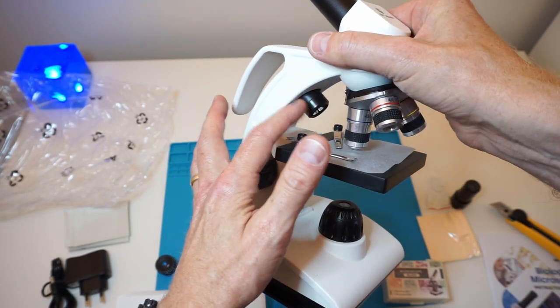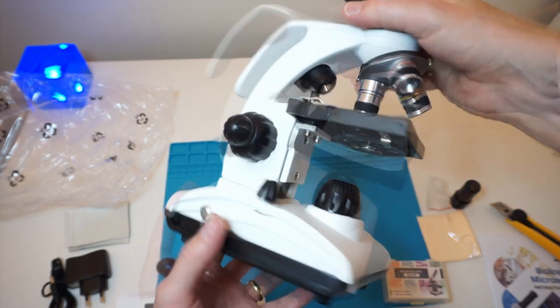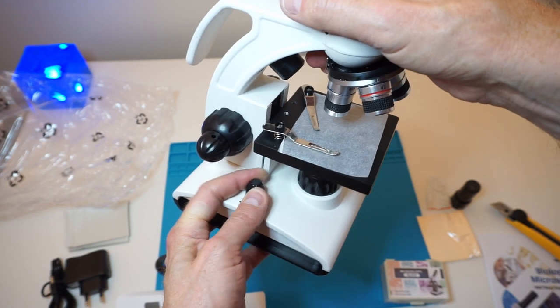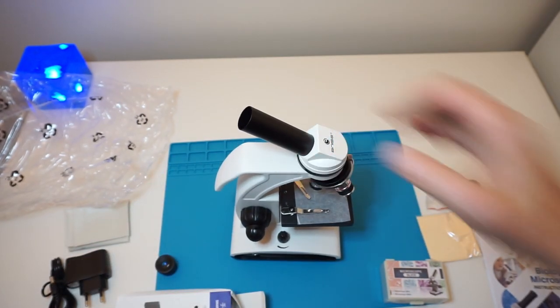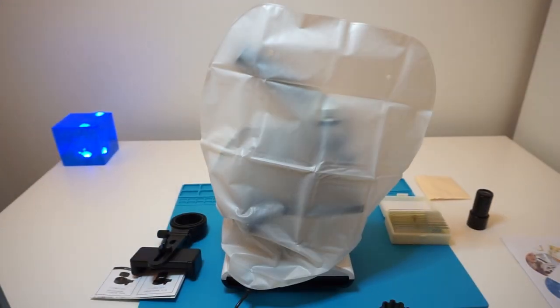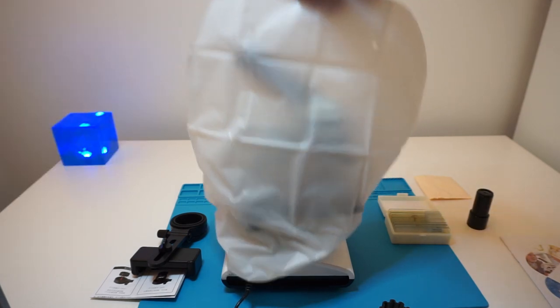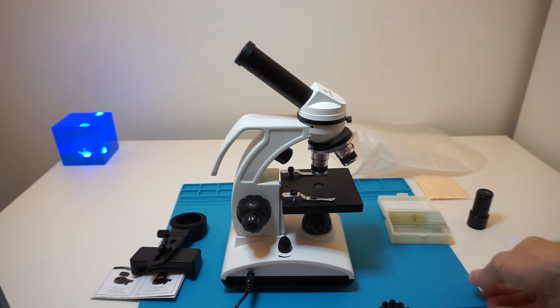We are going to use the lamp here. Okay, well, there's a dimmer. Let's set it on and see if we can somehow use this. All right, I set now the microscope in place. So you see there's a small hood here which protects it from dust.